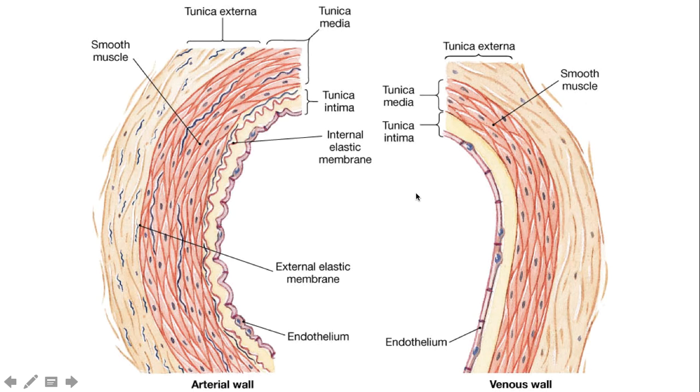For this next circulatory system video, we have the blood vessels. And so in lab, you're being asked to distinguish between arteries and veins, and then more specifically between muscular and elastic arteries. To help do that, I have first this figure out of a textbook just to highlight some of the similarities and differences between arteries and veins. And then we'll take a look at some of the histology slides that you'll be looking at in lab.